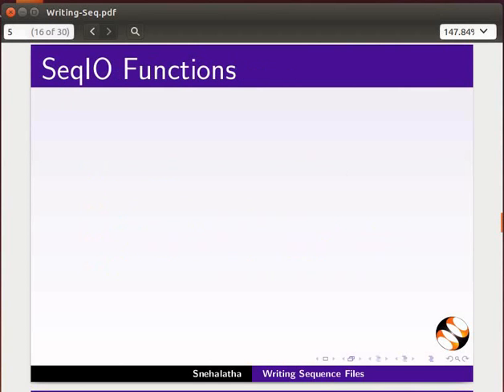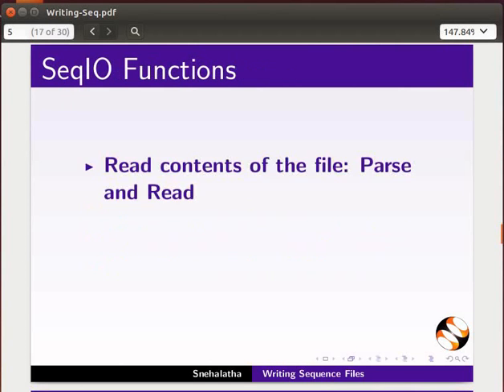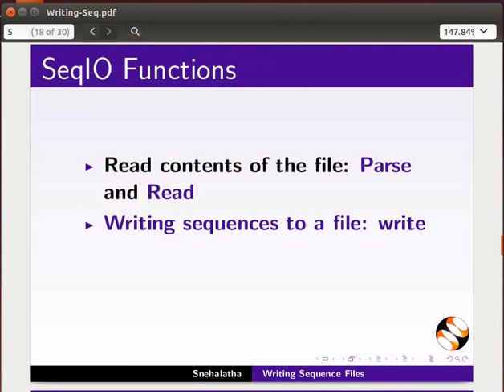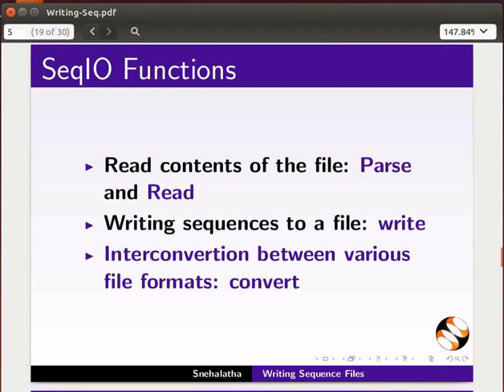We have earlier learnt about parse and read functions to read contents of a file. In this tutorial, we will learn how to use the write function to write sequences to a file, and use the convert function for interconversion between various file formats. Let me now demonstrate how to use the write function.